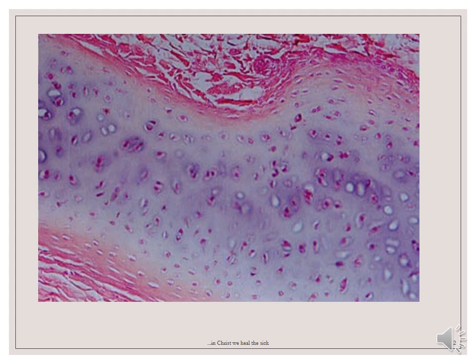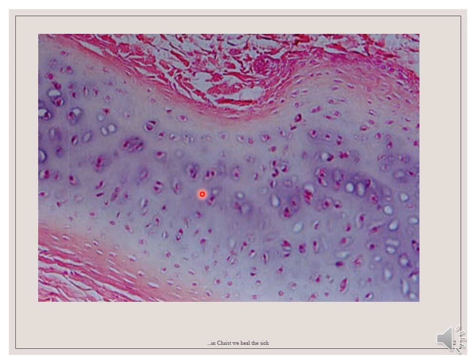The hyaline cartilage is composed of cells — as you can see here, these are cells called chondrocytes — and a homogeneous matrix. The chondrocytes are arranged in clusters, usually 2 to 4 cells. This is a cluster of 4 cells, and a cluster of 2 cells. These clusters are called isogenous cell groups.